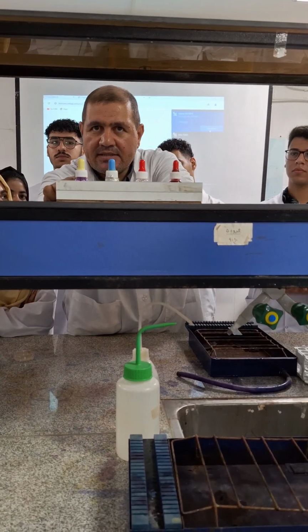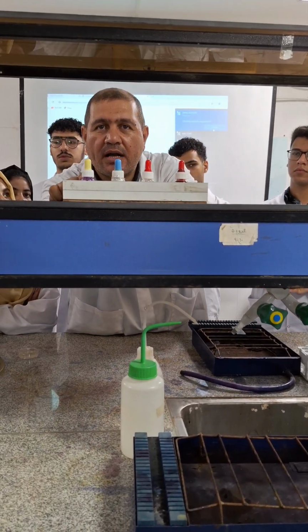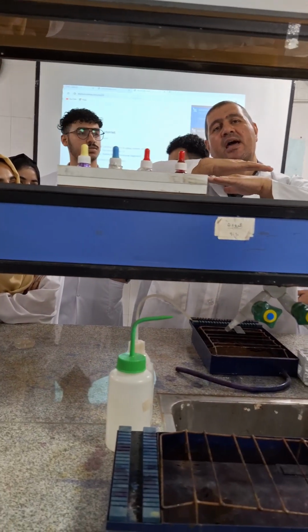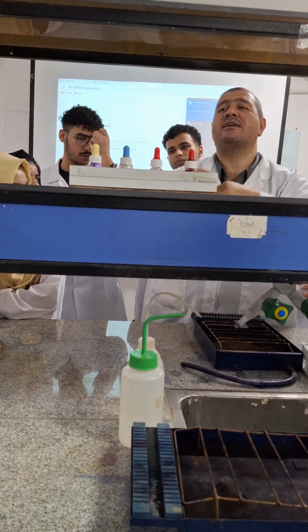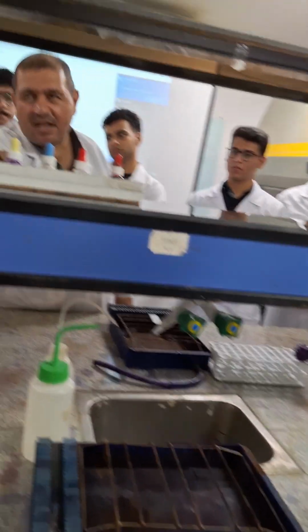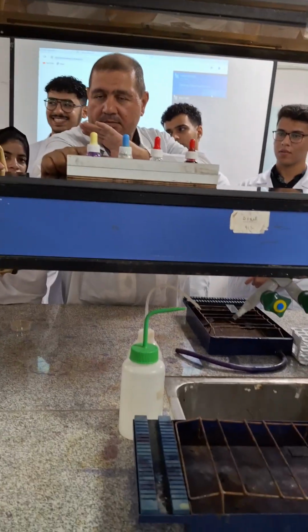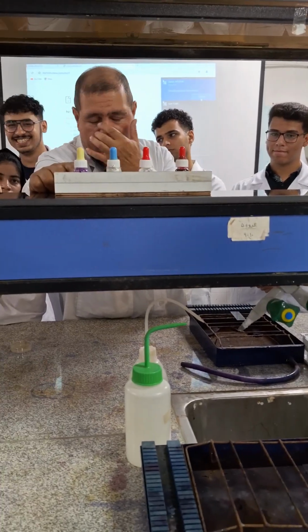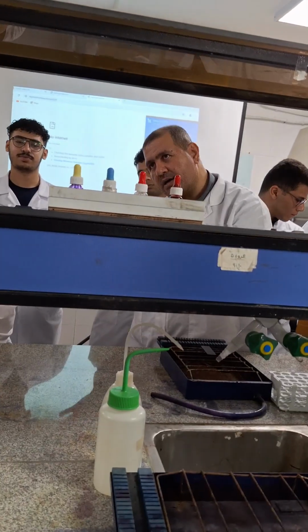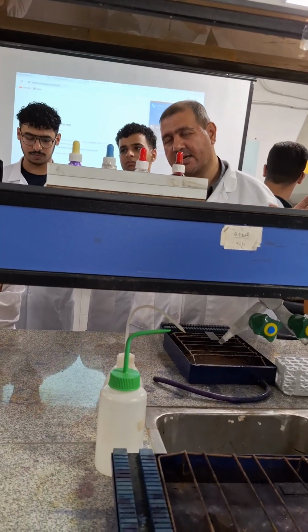Crystal violet reacts with peptidoglycan. The peptidoglycan layer in gram-positive is very thick, and because crystal violet reacts with peptidoglycan, you can see purple after staining.